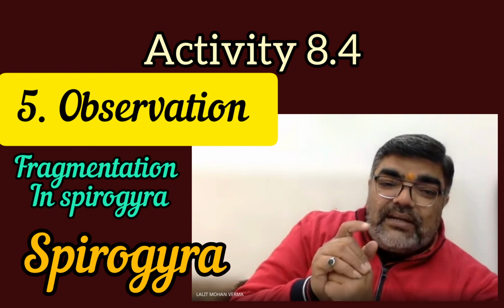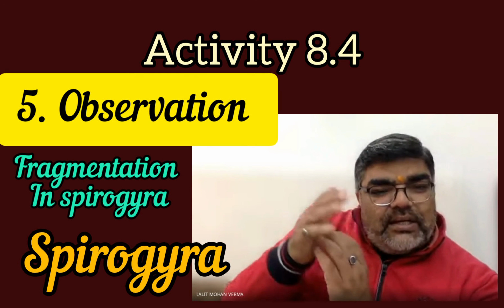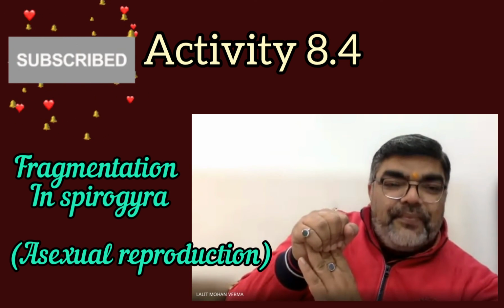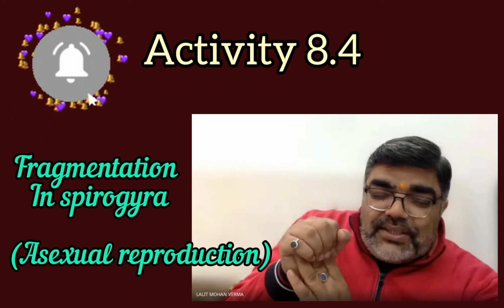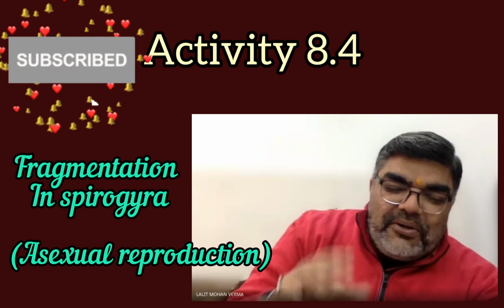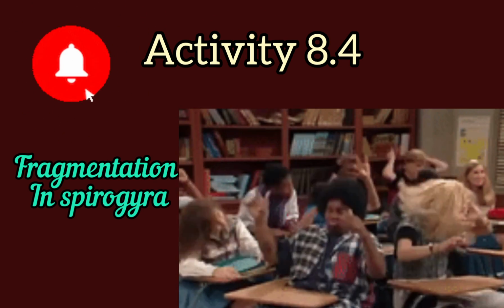So this activity is concerning the study of asexual reproduction, that is fragmentation, in Spirogyra. Got it or not? Yes, sir.